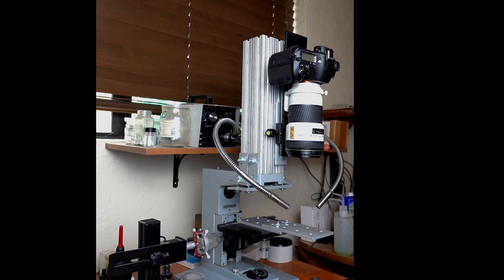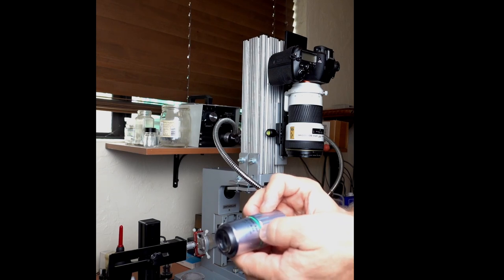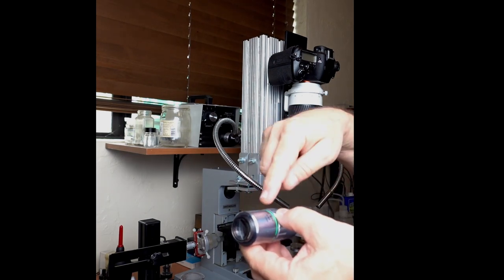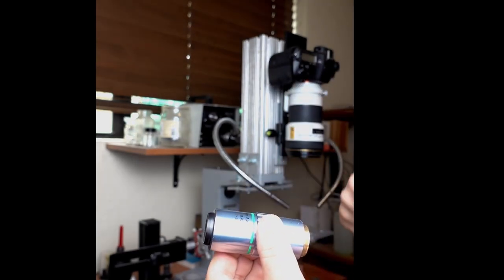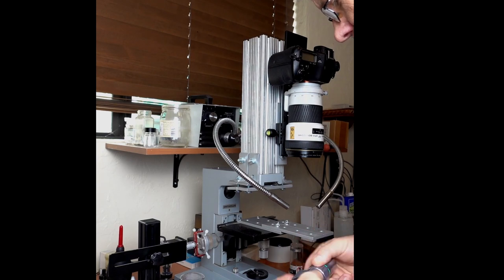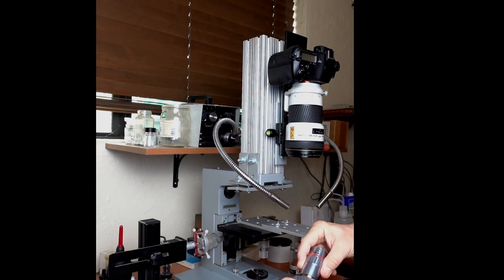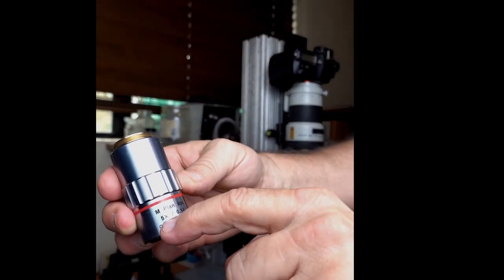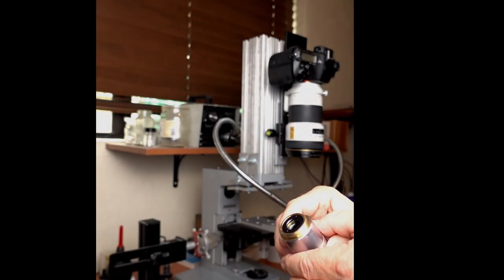I use these Mitutoyo objectives. They're industrial objectives. This one's a 20 power and it's also an APO, and it's an M plan. It's an infinity-focusing objective. It says F200 on it, which means it wants a 200 millimeter tube lens, which is why I've set the telephoto to 200. I also have a five-power. It's also an M plan APO, infinity-focus, 200 millimeter, and it's five-power with a numerical aperture of 0.14. Both of these are threaded the same.